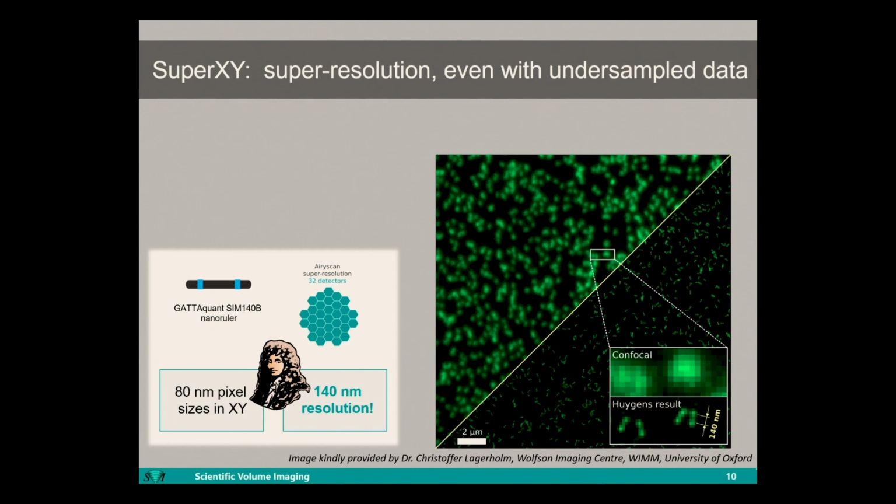fluorophores on these nanorulers. I would like to emphasize that the raw images have been kindly provided by Christopher Lagerholm from the Wolfson Imaging Center from the University of Oxford.